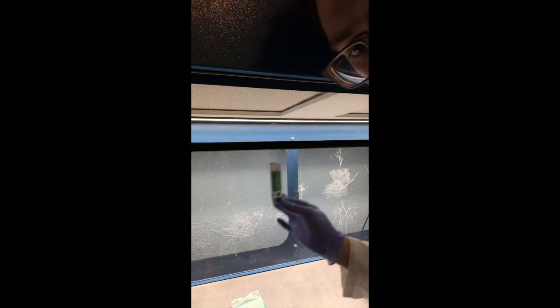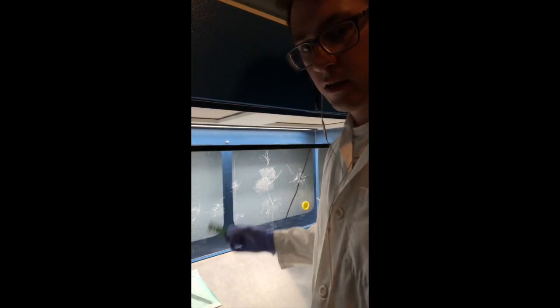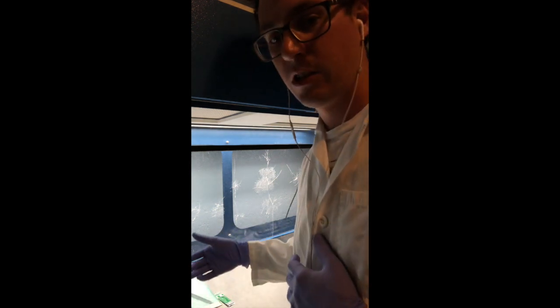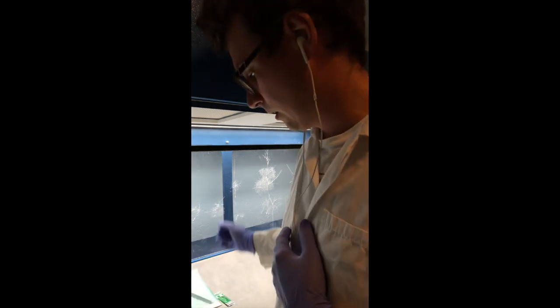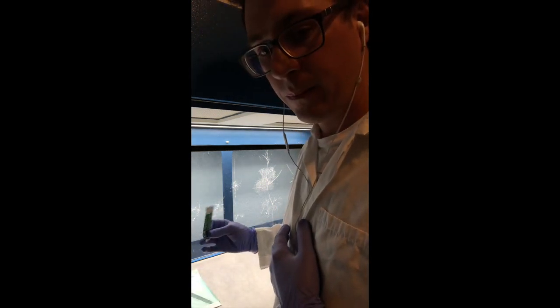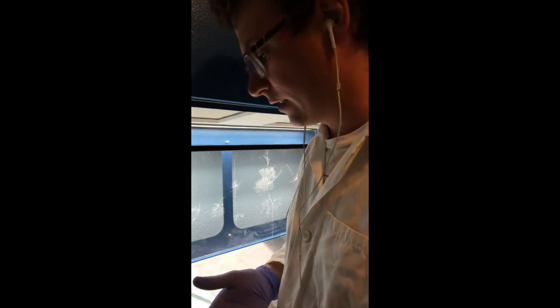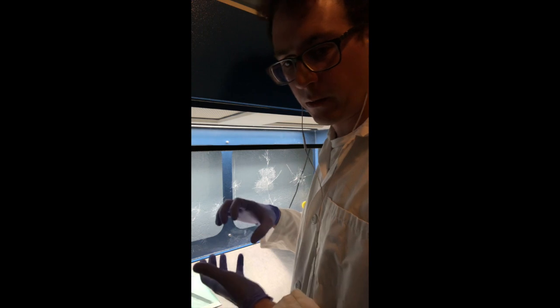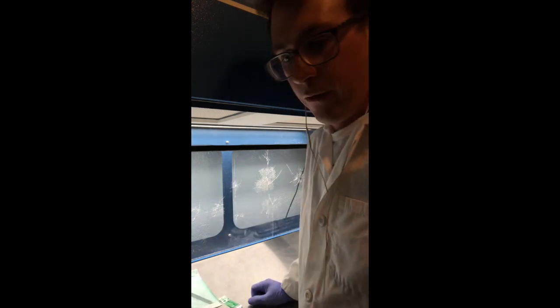I also use these sterile blades — I like the number 10s just because of the angle of the blade. It's just a personal preference but you can get these pretty cheap online. I always use one blade per strain so there's no cross contamination. Sometimes, especially with oyster mushrooms, you'll experience cross contamination and later down the line you won't even know it until they fruit. Another way to avoid contamination is flame sterilization, or you can purchase a ceramic sterilizer. But for my production I just use one blade per strain.